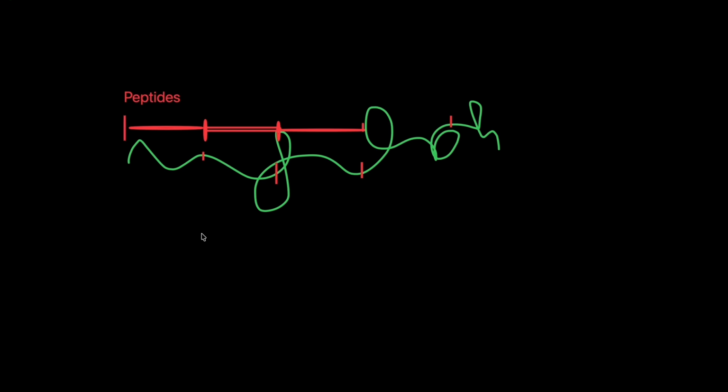One way of doing this is through endoproteases. Here we have a protease, like we mentioned before, that cuts every time after lysine or arginine.